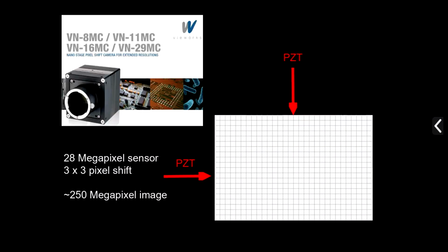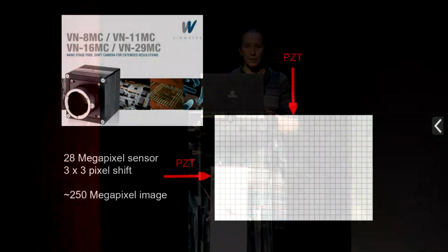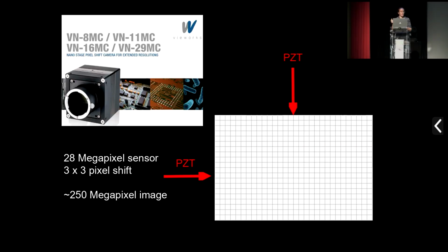Although we conceived of the lens being exclusively used for 3 dimensions, as soon as we started talking to people about it, we realised that actually camera imaging was going to be useful too. So we needed a camera. The problem was that we needed a camera that had over 250 megapixels that were the right size for us to perform Nyquist sampled imaging. So this is the solution that we have at the moment.